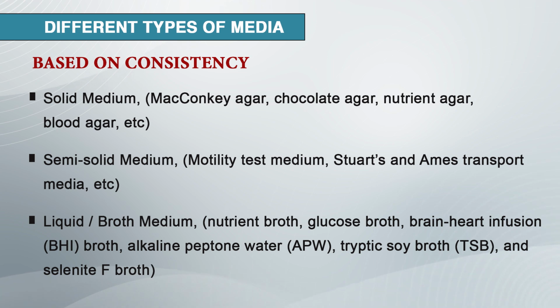Examples of semi-solid media are motility test medium and Amies transport medium, etc. Liquid broth media. Examples of liquid broth media are nutrient broth media, glucose broth media, alkaline peptone water media, etc. In this media, agar is not used and it is in liquid condition.